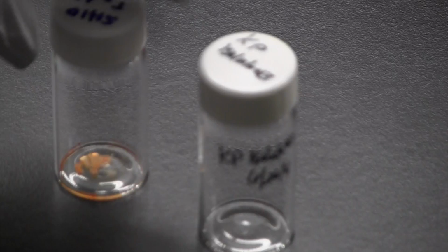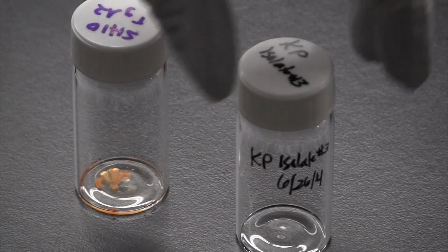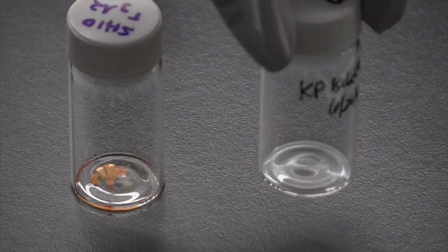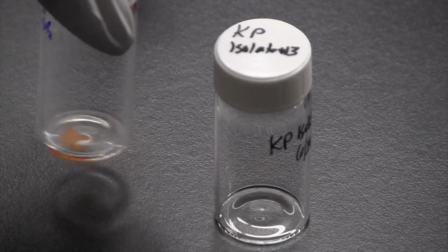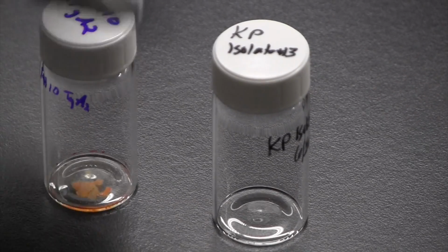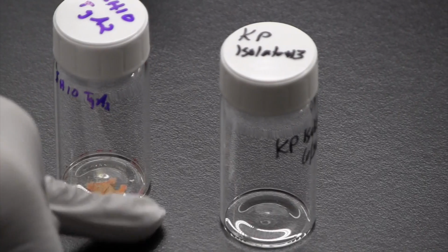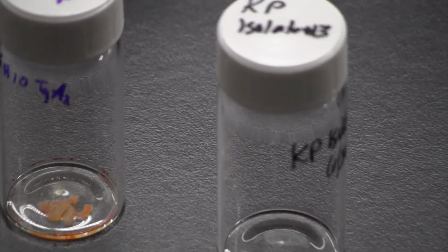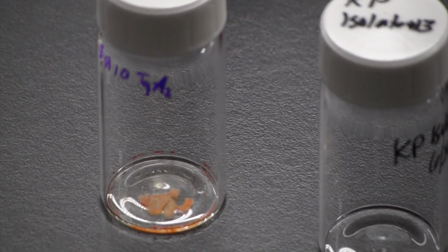What I just wanted to illustrate here is that in my isolate, my extract here, you can't even really tell there's anything in the bottle at all. There's no apparent color. There's a little bit of texture maybe. But this student's extract, you can hopefully see there's some real clear orange pigment that has been concentrated down as a result of that ethyl acetate drying down over that 24-hour period.